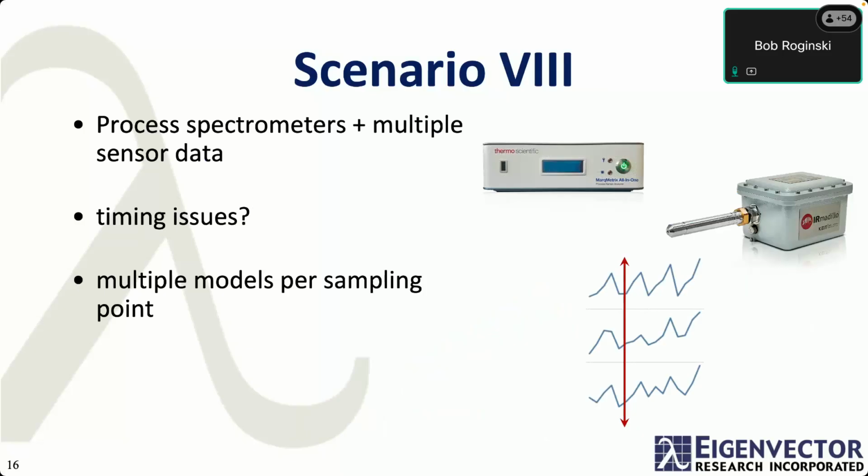That means that for the other, faster measurement, I'm doing many more of those. So how do I handle that? Do I average them, or do I just take the measurement at the beginning of the NMR cycle from the spectroscopic? Those are things that you can work out in development, and then determine the best way to build that model and then deploy it.